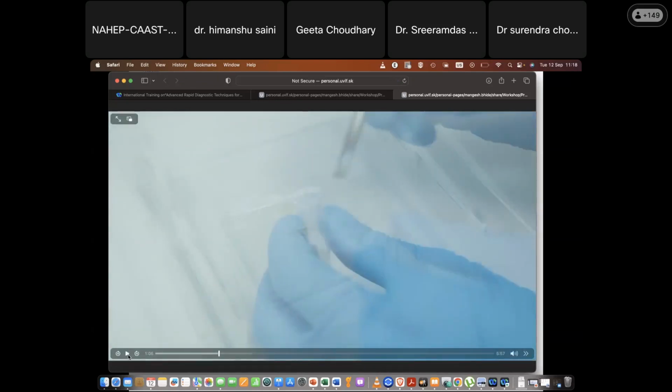Okay, so the first step of the gel extraction is you cut the gel with a scalpel. We normally use surgical scalpels for that. But the main thing is that you have to burn the scalpel before cutting. You put it into ethanol and burn it, so all the DNA and everything will go away. No cross contamination.